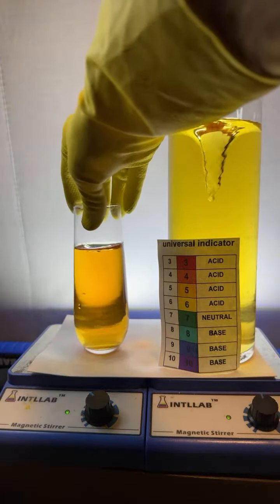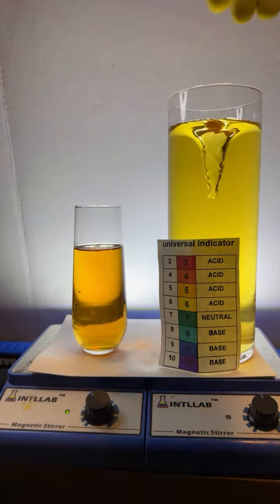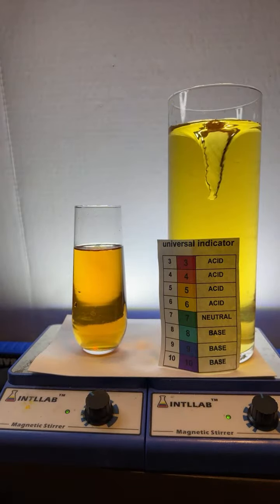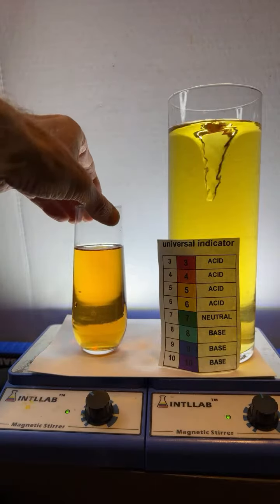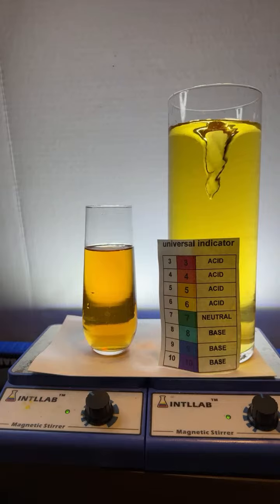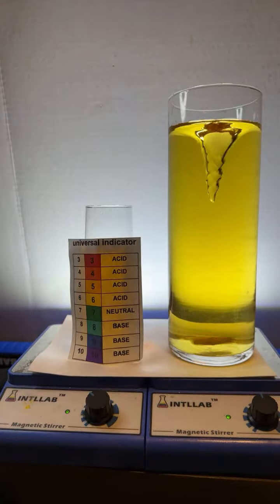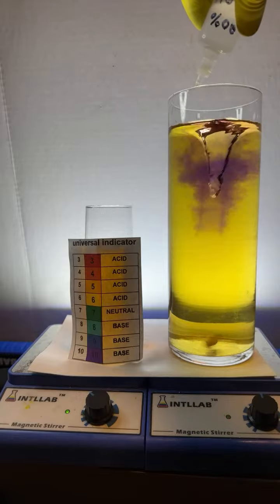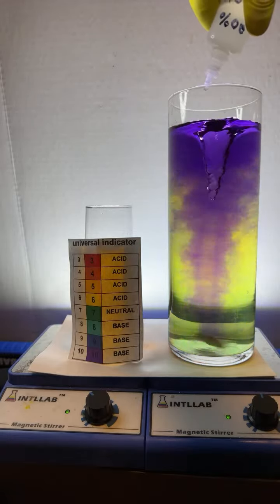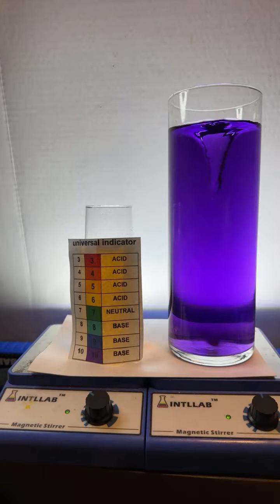Well, here's the deal. Any water that has been exposed to the atmosphere has carbon dioxide from the air going into it, and when carbon dioxide goes into water, it makes the water acidic. You're like, come on, man, that can't be right. Well, let me show you. I'm going to move this over here. We're going to make this basic by adding a lot of base. Then I'm going to add some carbon dioxide to it, and if the carbon dioxide is an acid, the pH should drop, right?